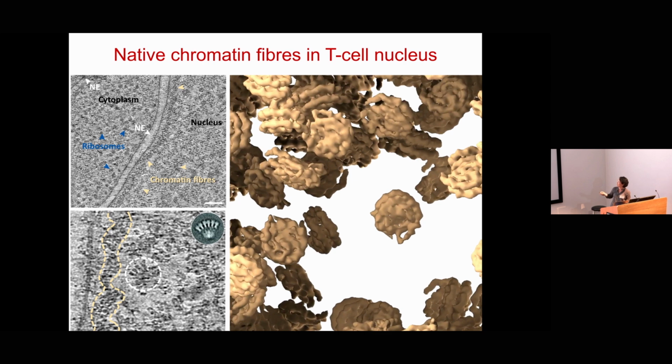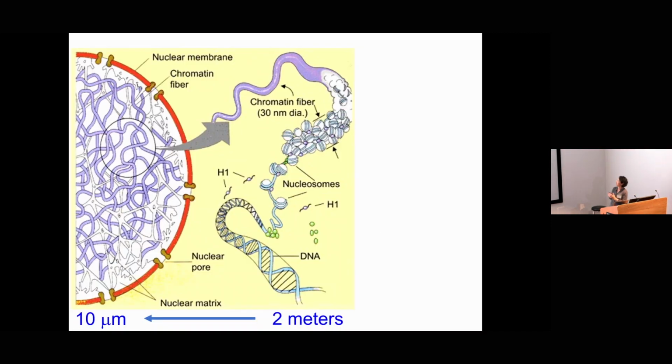And we also can analyze those nucleosomes, whether they have a linker histone H1 there or not, and how they distribute. It's very important because this picture shows how you package 2 meter DNA into a 10 micron cell nucleus. There are models of DNA wrapping around the histone octamer to form nucleosomes, and the nucleosomes form secondary order structures that are called 30 nanometer fibers. Then they further organize the 3D genome in the nucleus.